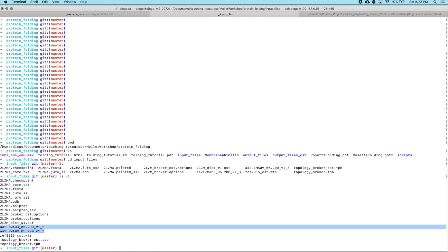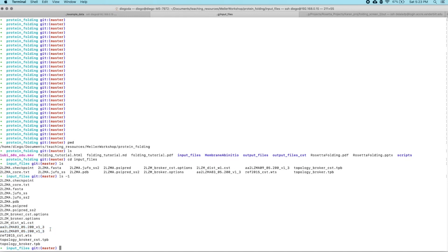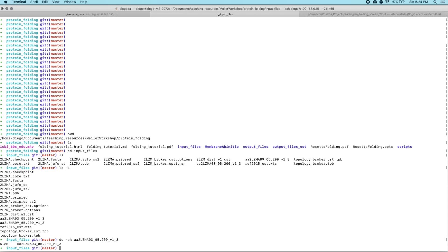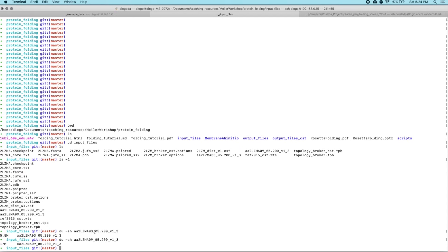But perhaps most importantly are the two fragment files over here. Now I can take a look at what these fragment files are, but the one thing I want to impress upon you is that these files are gigantic. This protein is only going to be a little over 100 residues, and yet we can get the size of the file using the command DU. We can see that the three residue fragment files are 5.8 megabytes, and then the 9 residue fragments are 17 megabytes. So if you were to work on a protein that was 5 times larger, those files will be 5 times larger as well, and so it doesn't make sense to open them in a text editor.